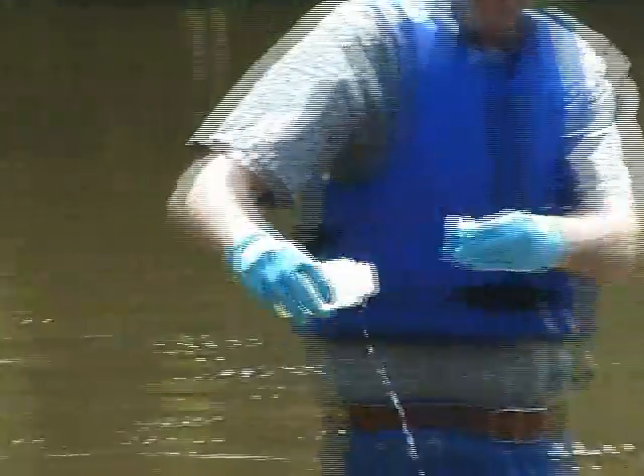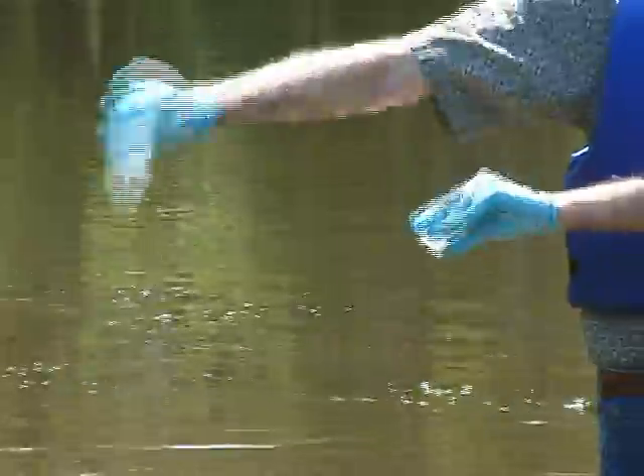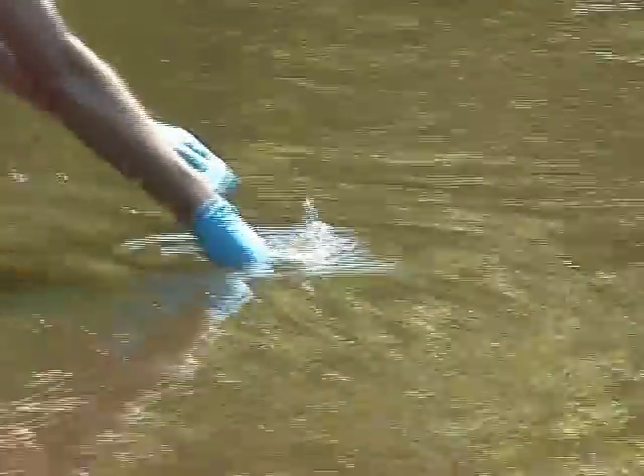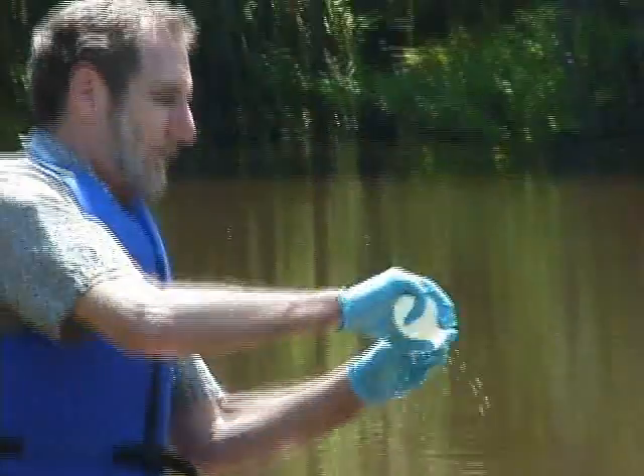Shake it, dump it out behind you, and simply do that a few times to rinse out and clean the bottle.